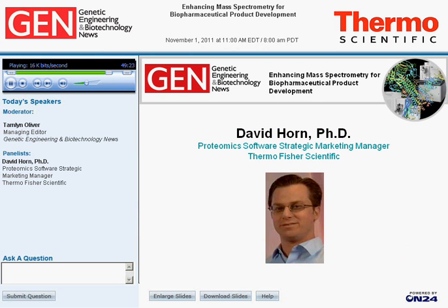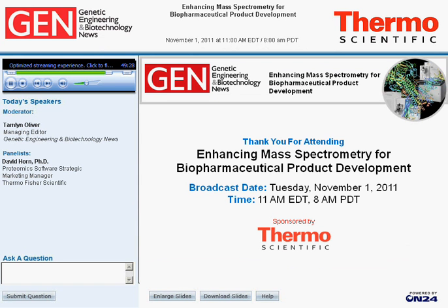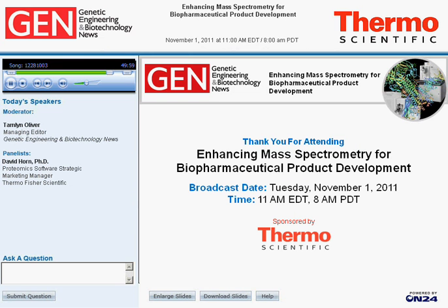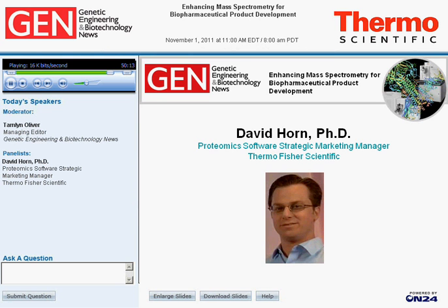Okay. Our next question is, how do these compare to TOF? Yeah, that's a tough question to answer, mainly because I don't have a direct comparison for the most part of exactly the same sample. But in my experience, I've seen a lot of data files from TOF systems, and I just noticed that the Orbitrap systems, especially the latest version, produce very clean-looking data. As I'd mentioned before, the spectra for the intact protein, the raw data almost looks like a deconvoluted spectrum by itself, and I have seen this time and time again on the new generation of instruments. So at this point, in general, the spectra do seem to look cleaner.